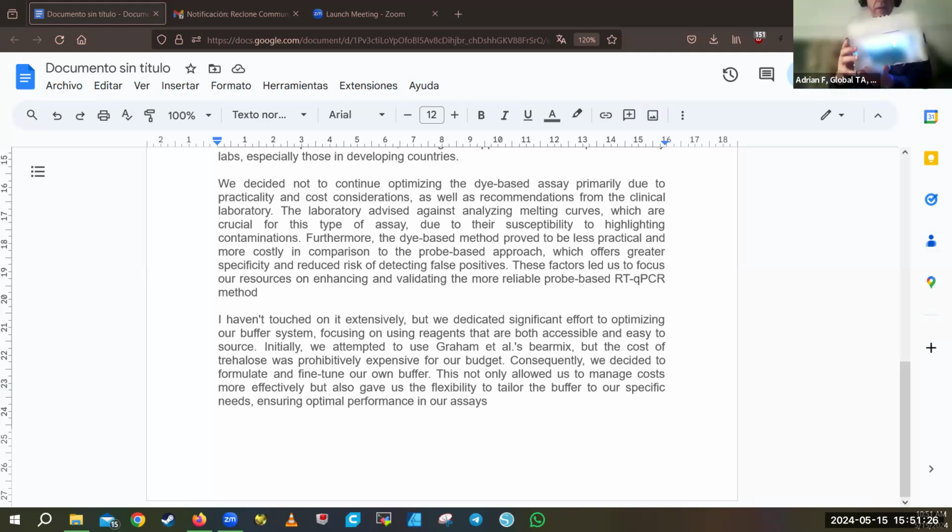The interesting part is that I was thinking maybe I can film directly when the gel runs, and we might be able to use an algorithm to use the motion instead of just the plain picture and correct the sensitivity.